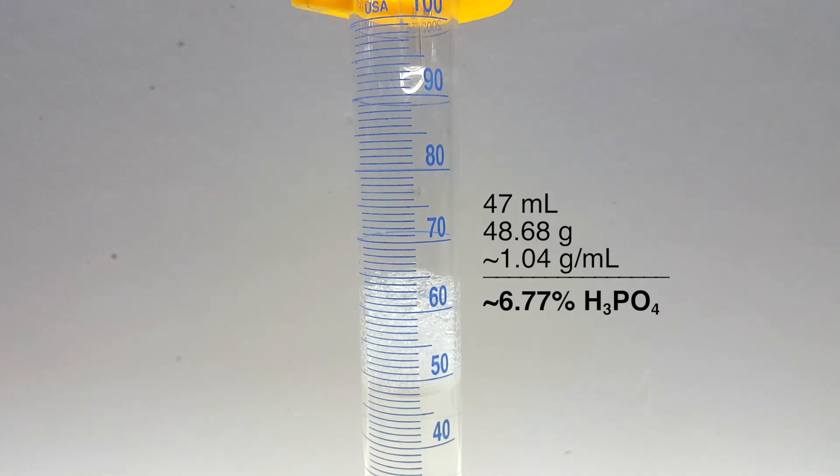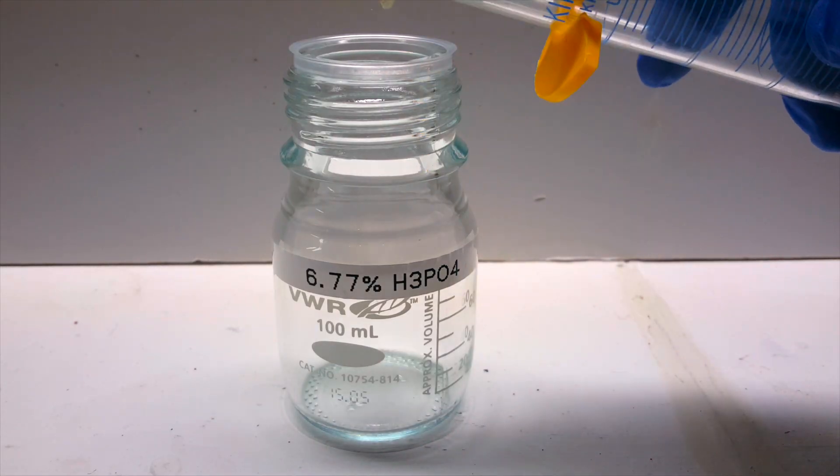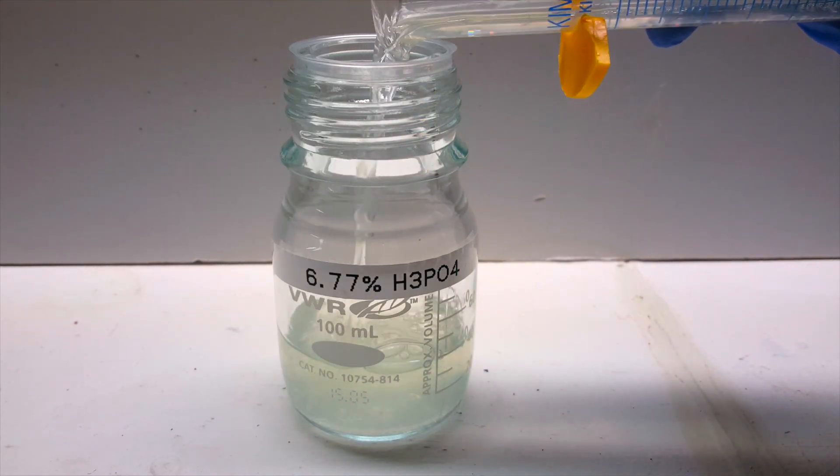This gave the acid a density of about 1.04 grams per milliliter, and at 18 degrees Celsius, this corresponded to about 6.77% phosphoric acid by weight. This means the original rust remover was only 0.7% acid, so there must have been a good amount of degradation over time, or through losses in my trial. I poured this into a storage container and I had my final dilute product.